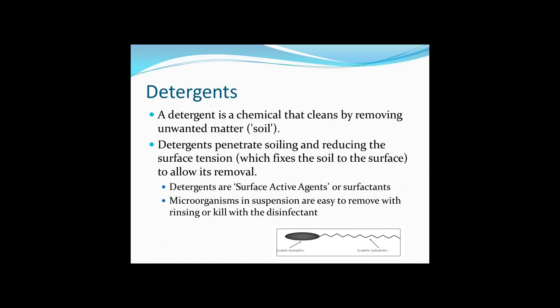So here microbiologists will talk about two different states. If the microorganism is attached to the surface, then it's often called in the sessile state, and that means it's harder for the disinfectant to kill it. If it's detached from the surface, then it's often referred to as being in the planktonic state, which is a derivation of plankton floating around in the water, and they're far easier to kill. So the detergent has a very, very vital role in the step leading into disinfection.